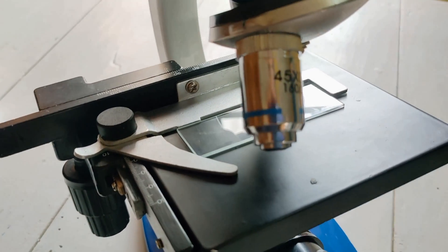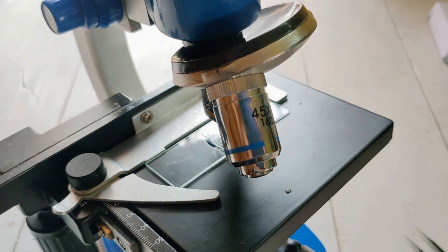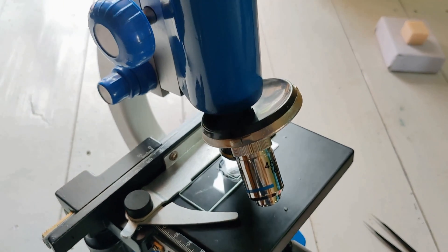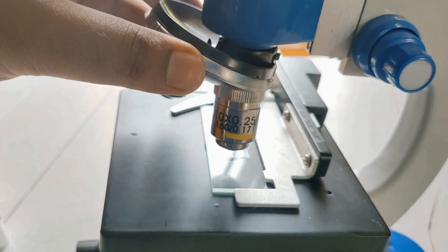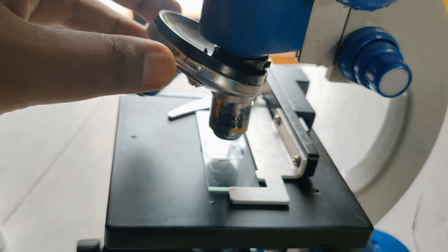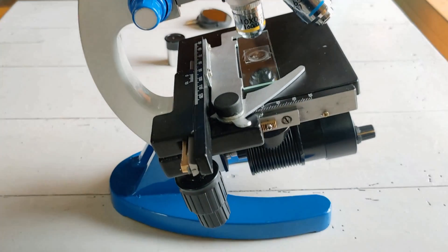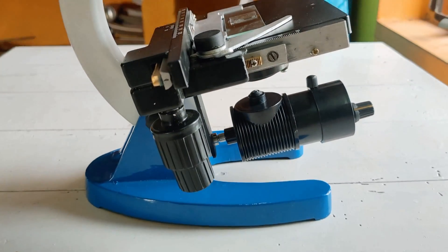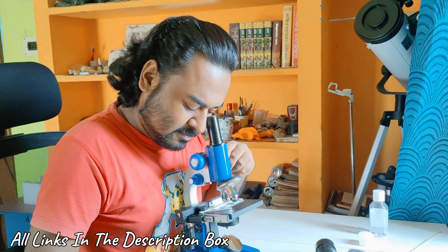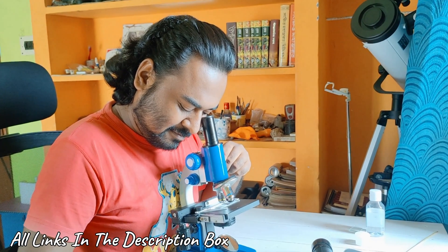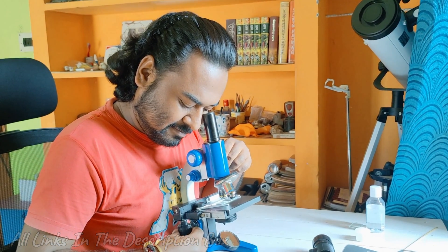With 10x eyepiece and this 45x objective lens, you can get 450x zoom, and with this 10x lens you can get 100x zoom. With 4mm telescope eyepiece, you can get up to 2000x zoom with this microscope, which is really huge and also very hard to focus. So let me start with the basic one. Hope you know this thing.